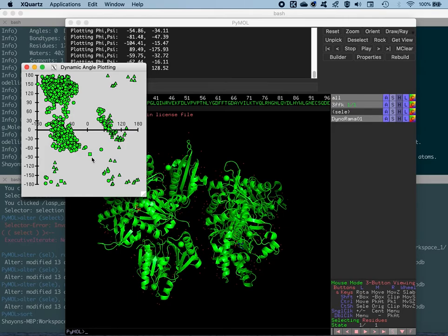Although its side chain is cyclic and supposed to be highly steric in nature and occupy a region around negative 60 degrees on the phi axis, which is the x-axis, which you can find out here with all the squares, sometimes some proline residues might occupy these regions, which belong to the coil or turn, the more flexible regions of the protein. The reason being, it's easier for them to move around in that region, even with that sturdy or sterically hindered side chain.